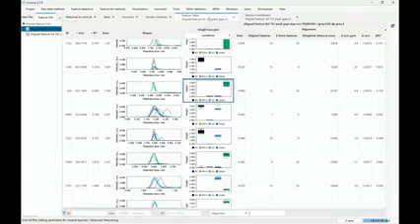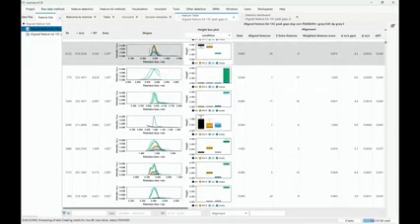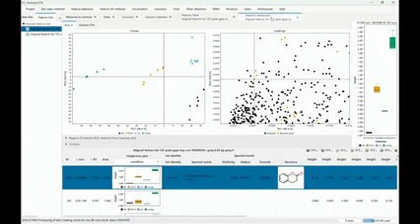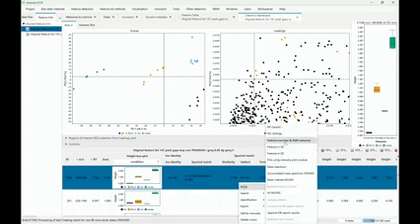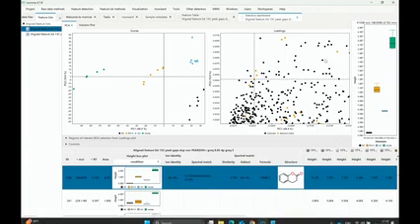And so from here, I just want to highlight mostly you would be working with the table, maybe with the statistics dashboard, and always make sure to right-click and see what options there are. We have the spectral database search results. They are also present, as you've seen, in the feature overview. Also, if you have lipid matches, if you're going for lipids, you're also going to see them in the feature overview, but there's also other lipid methods that you can use for visualization.